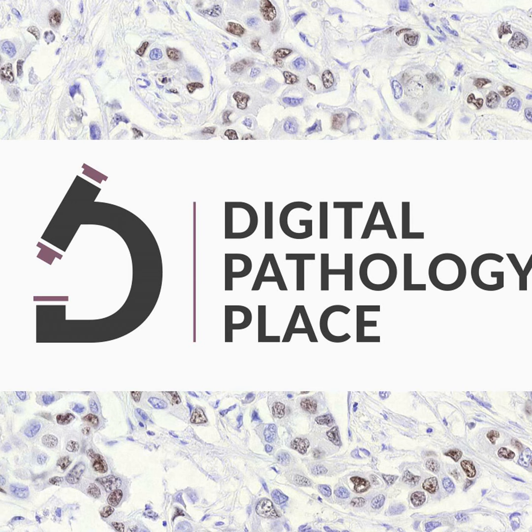It helps stabilize the phone on the ocular, and so you can take photos of what you're seeing, focal areas. I see cells over here. I'm worried about these cells, or maybe have a particular question about this group of cells, and send those via the app to the pathologist, which right now is me, but I plan to expand that over time for review.